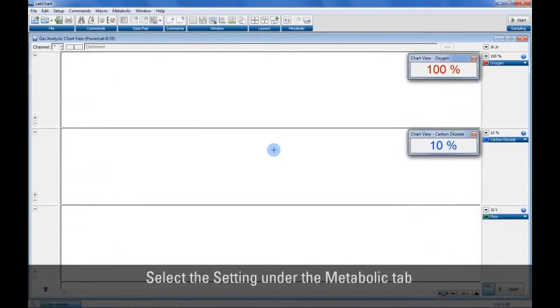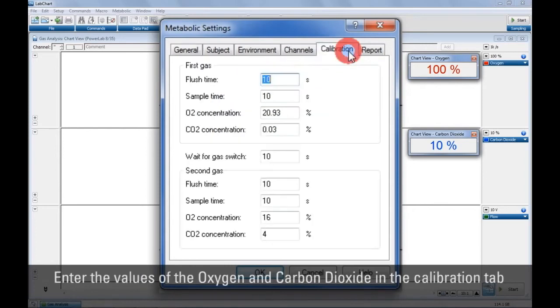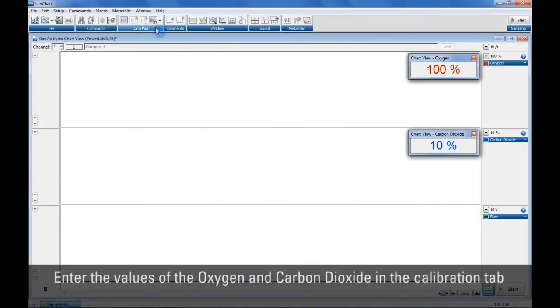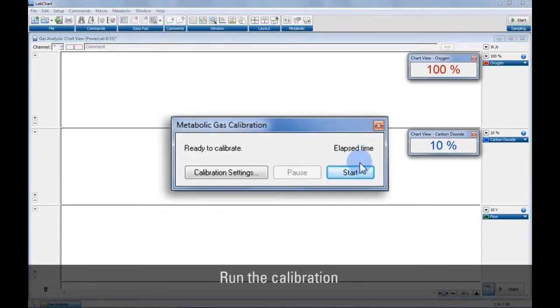Alternatively, you can calibrate the gas analyzer using the LabChart metabolic module. Select the setting under the Metabolic tab. Then go to the Calibration tab and enter the values of the oxygen and carbon dioxide for the known gas you will use and click the OK button. After that, go back to the Metabolic tab and select Run Calibration.